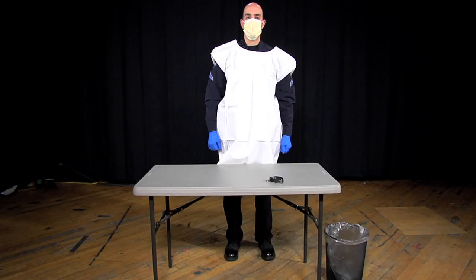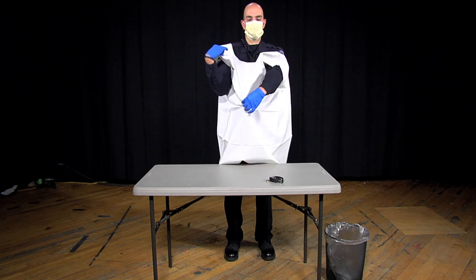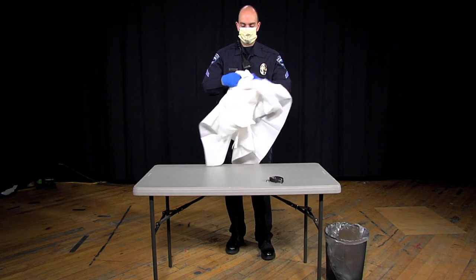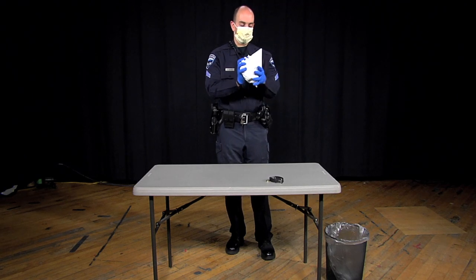Keep in mind that an accidental exposure can occur while removing your equipment. You will want to have a trash bag and garbage can nearby to discard the used PPE as you remove it. If you are wearing a gown or apron, that will be removed first. Grab the outside of the gown and pull away from your body. As you remove the gown, roll it into a bundle inside out and place it in the trash bag.